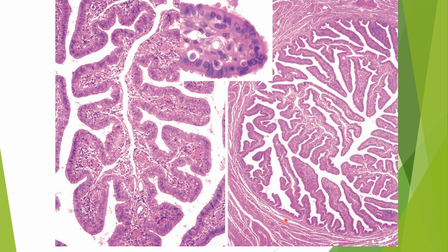Beneath the mucosa there is the muscularis, which again consists of inner circularly arranged smooth muscle cells and outer longitudinally arranged ones. So histologically, I repeat, it consists of the layers: the mucosa, muscularis, and serosa. The mucosa consists of epithelium and connective tissue, the epithelium being simple columnar in nature and partly ciliated and partly unciliated. Then the muscularis layer, and outer to the muscularis is the serosa.